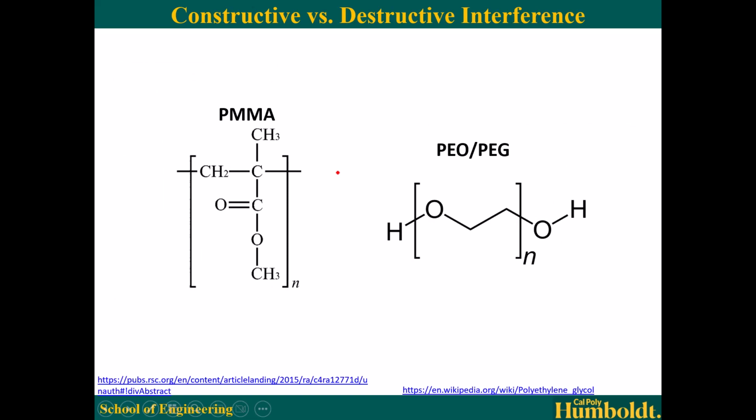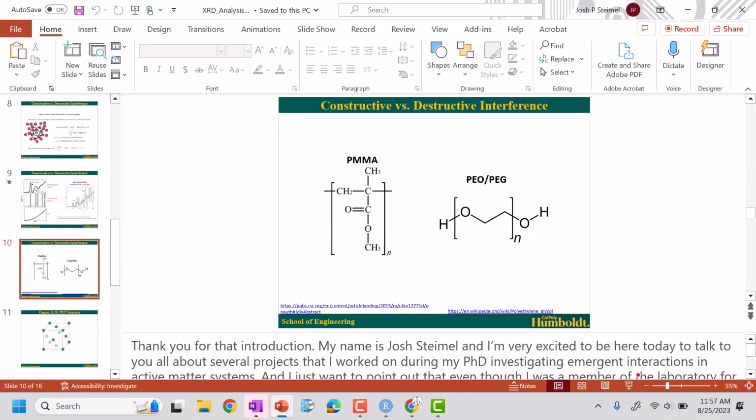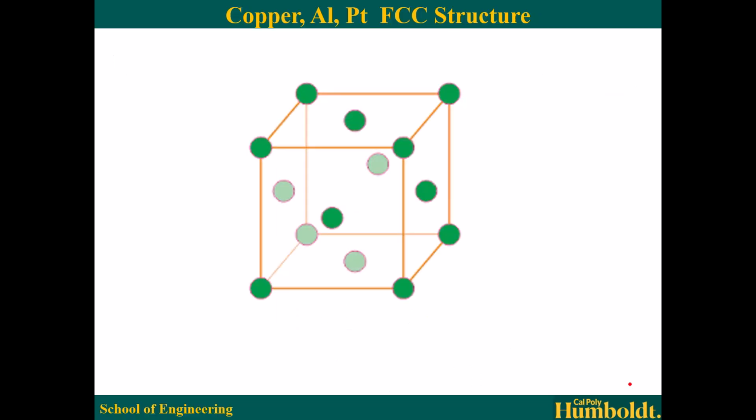PMMA and PEO. Actually, speaking of germane to the discussion, I want to see if I can write.